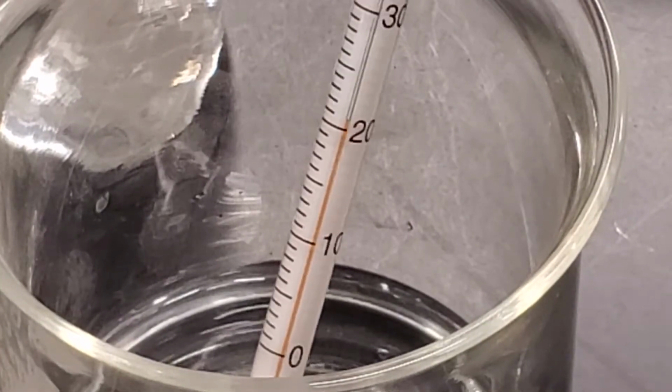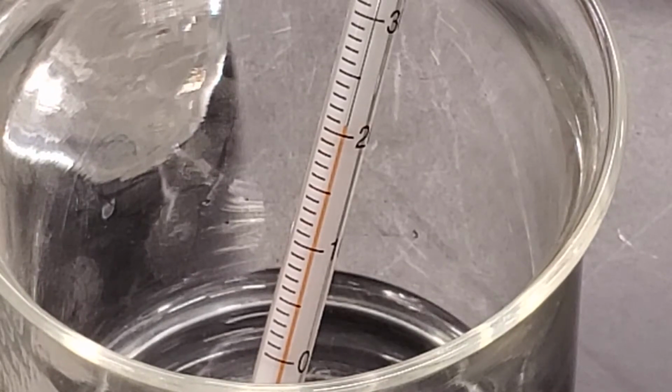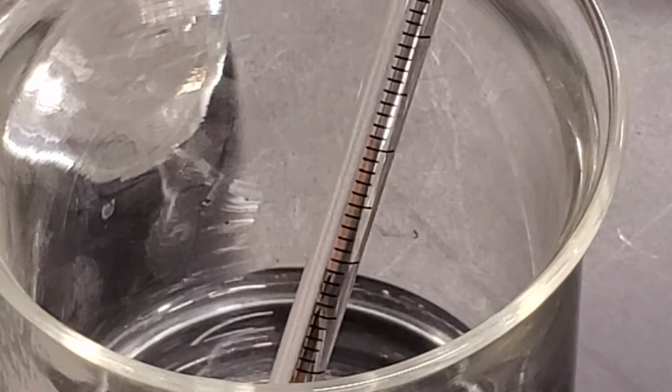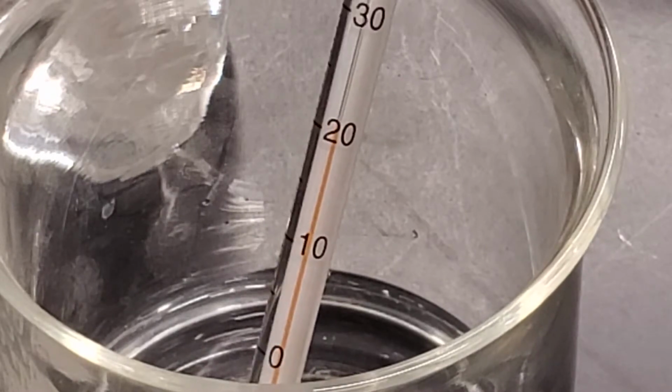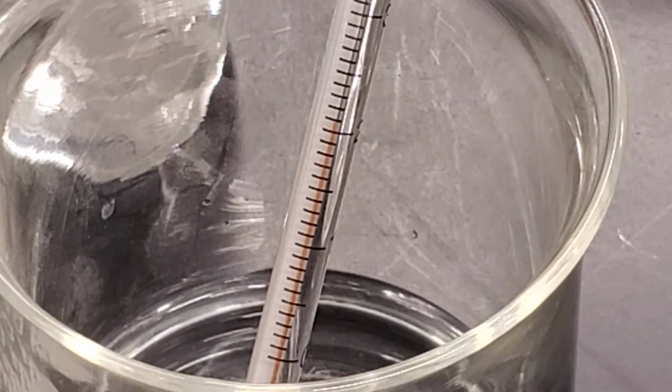So what we're looking at is that red line, and we want to see where that line reaches. The bigger line that we see there is 20 degrees Celsius. This just happens to be in Celsius. We'll give it another few seconds just in case that temperature moves ever so slightly. And it looks like the temperature is going to remain at that first short hash mark.